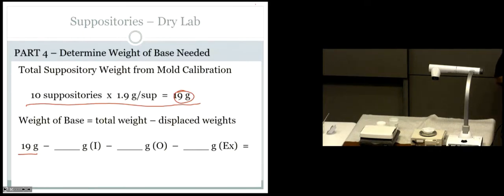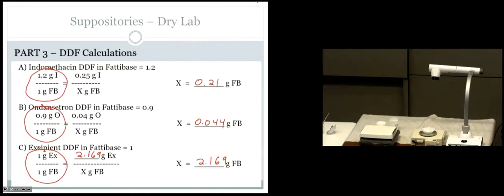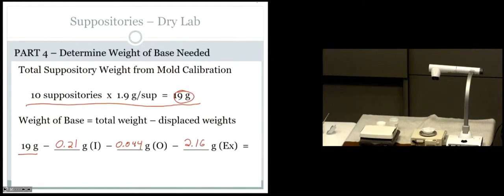So do you remember, what was the value for the indomethacin? It was 0.21 grams displaced. Okay, for the ondansetron, it was 0.044 grams displaced. And the excipients, because it had the same weight, was the 2.168? Gosh, short-term memory. 2.169. Right, so you do that, I do that, we've got to get new numbers.